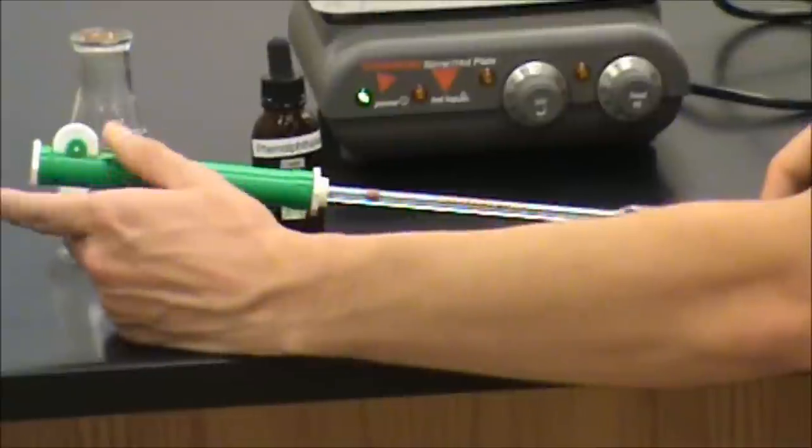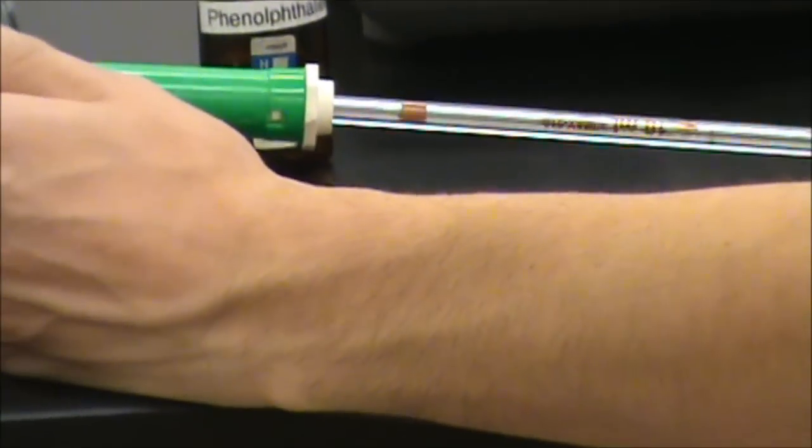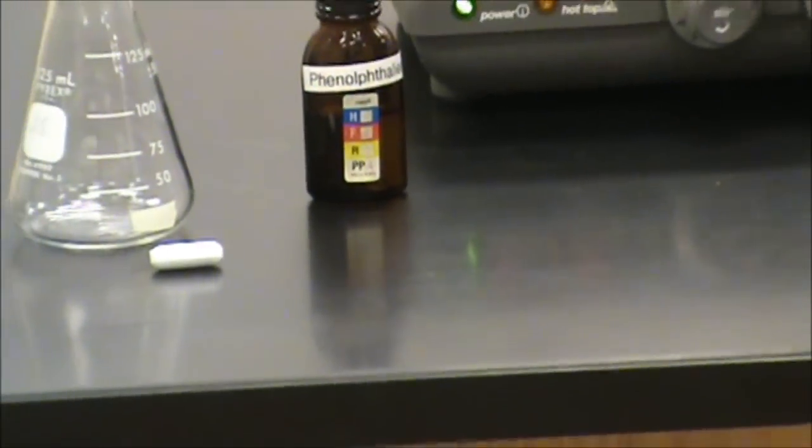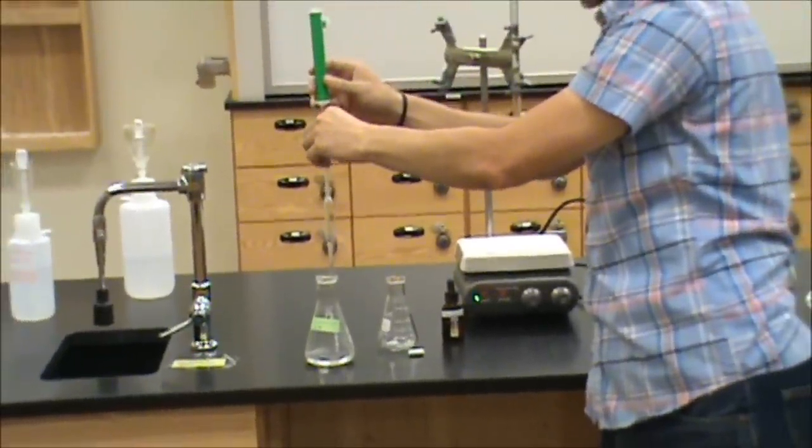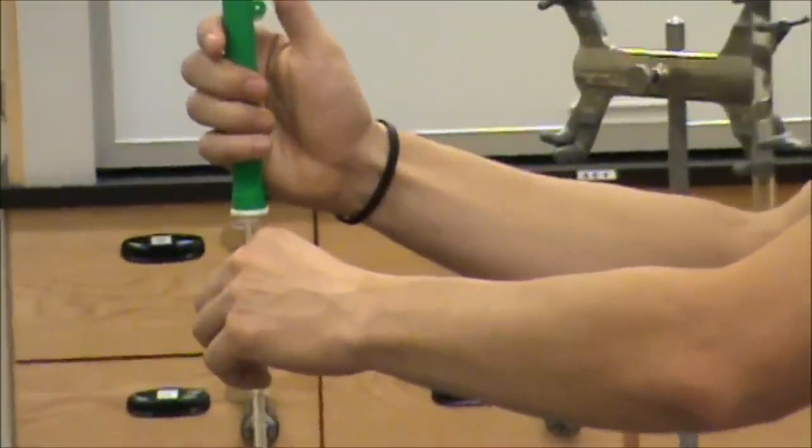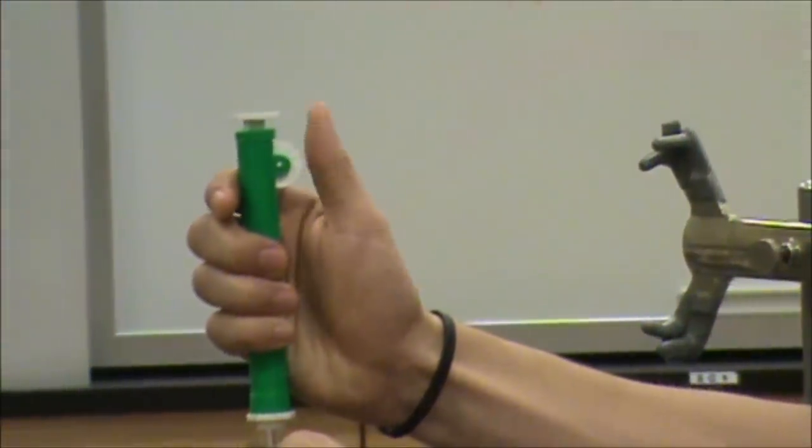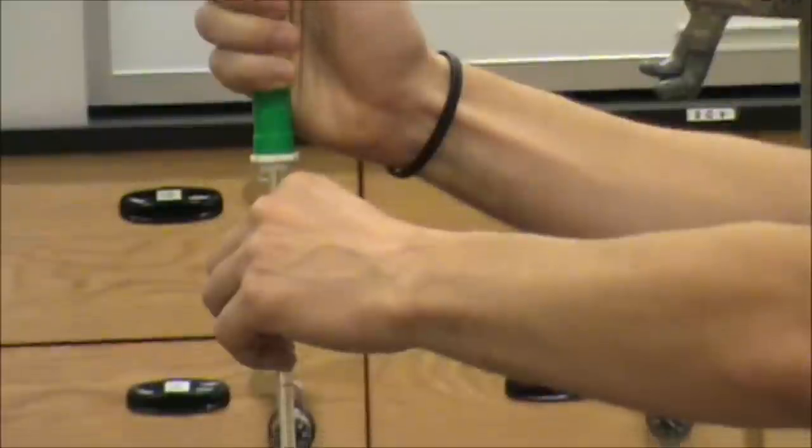In order to operate this, we want to insert it gently but snugly into the end of the pipette pump. When we are ready to measure the fluid, we want to gently use the thumb wheel to draw fluid up into the volumetric pipette.